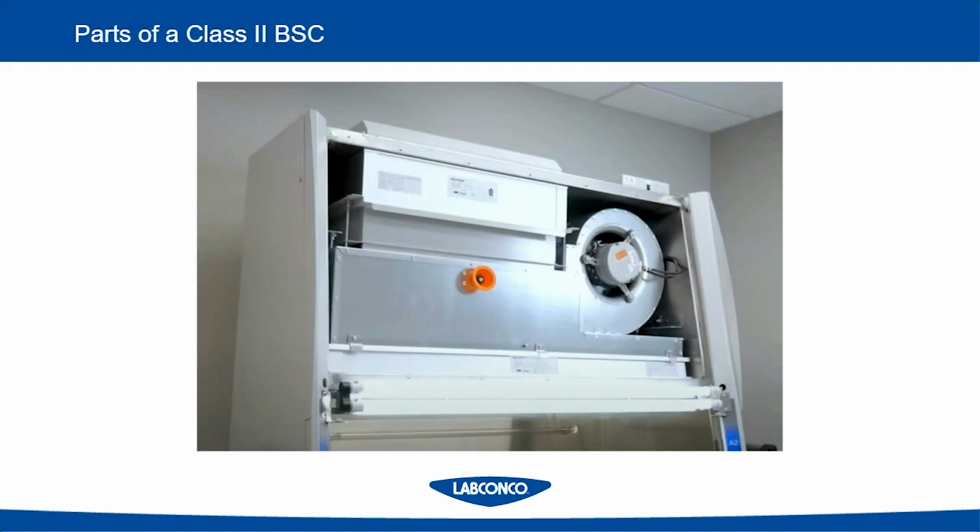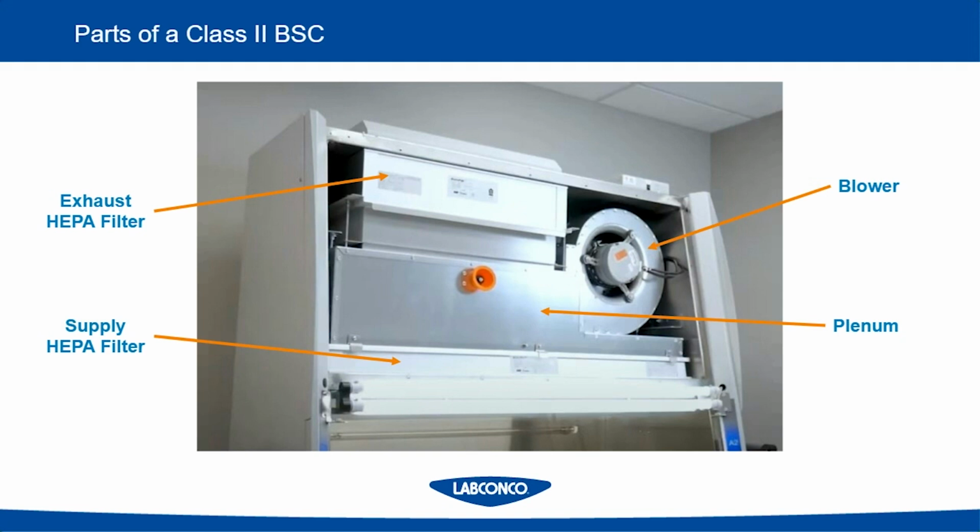At the top of a biosafety cabinet, you have some main components that make the whole process work. First, and perhaps the most important parts, which we've already talked about, are the supply and the exhaust HEPA filter. Next, you're going to have a blower. Some models even have two blowers. This is what's providing that airflow movement through the cabinet. And then you're going to have some sort of a plenum, and these plenum designs will vary depending on the type of BSC, which we'll get into shortly.